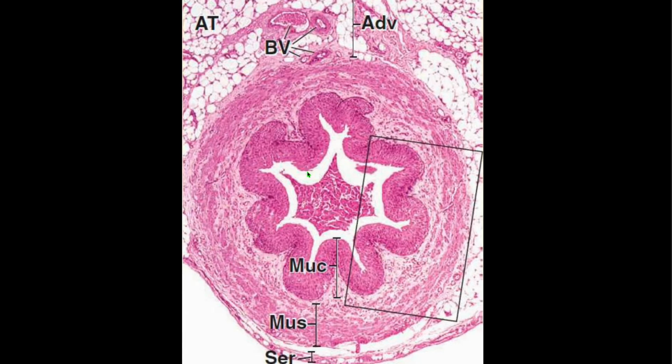We are going to see the ureters in this video. The ureters are paired tubular structures that convey urine from the kidneys to the urinary bladder. They are lined with transitional epithelium, otherwise known as urothelium. It is an impervious layer that lines the urinary excretory passages from the renal calyces through the urethra.